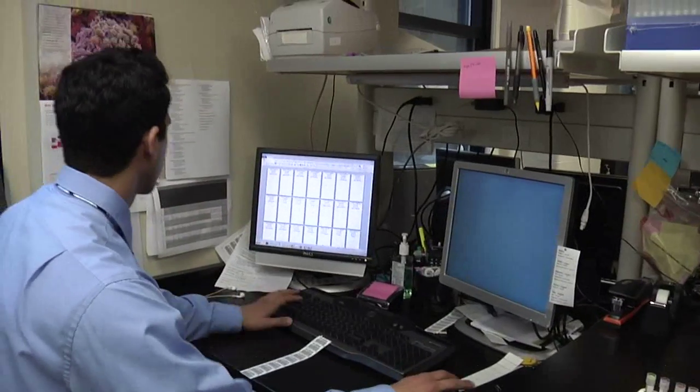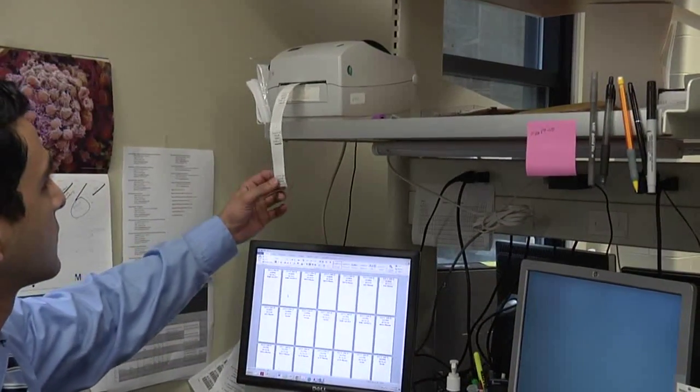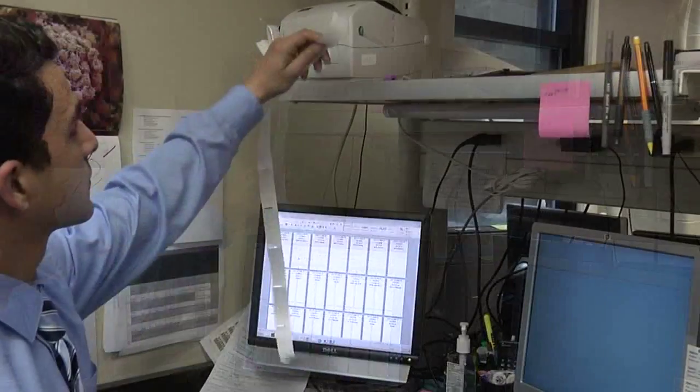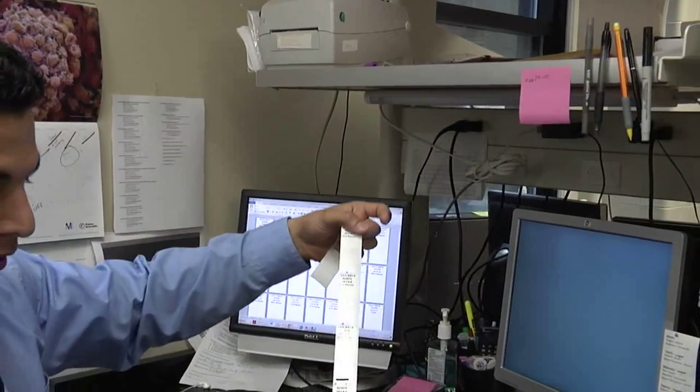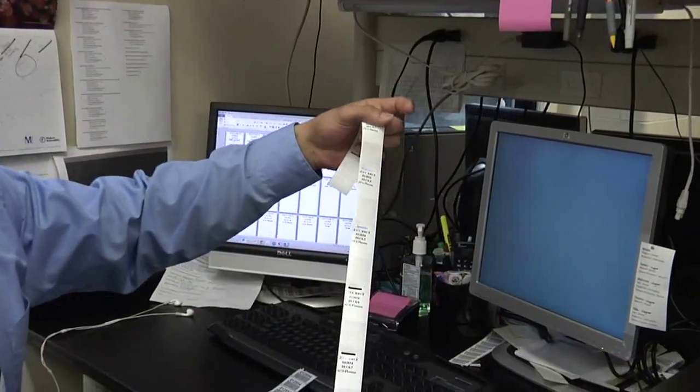Place the samples here and start printing off the labels. Here comes the labels. Each label has a barcode and a location of the tube.